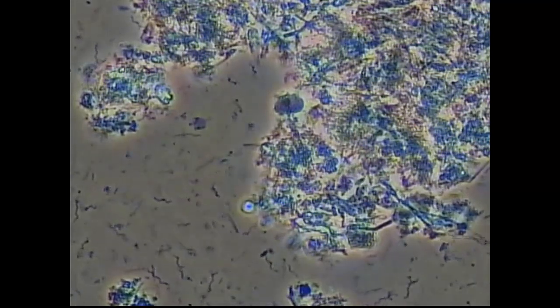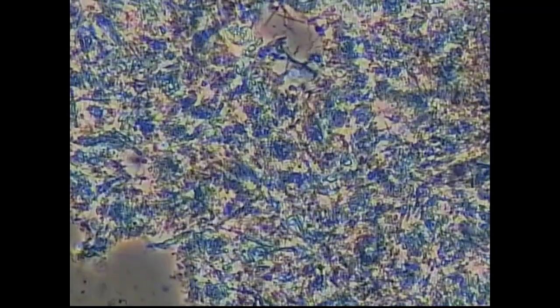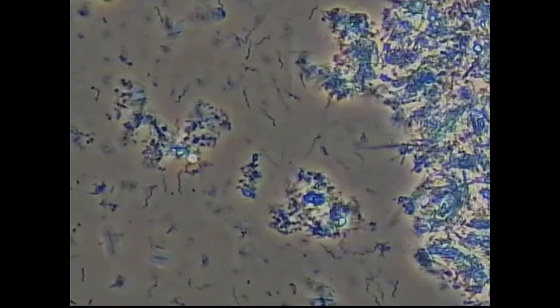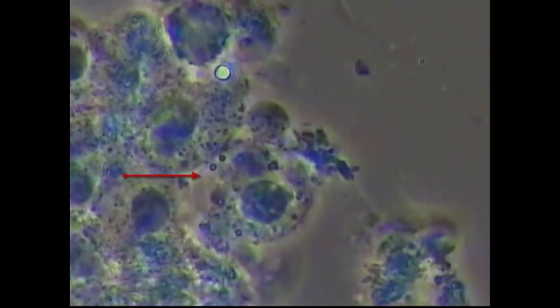PMNs are again trying to mount a response. They're under attack by the spirochetes, as you can see as we move over the slide. As far as numbers go, there are definitely more spirochetes than there are white blood cells to fight the infection. This is the same slide increased to 1,000 power. Here you can see a PMN that's got two of the spore forms — they look like clear vacuoles in it. That's how the spirochete manages to avoid our immune system.